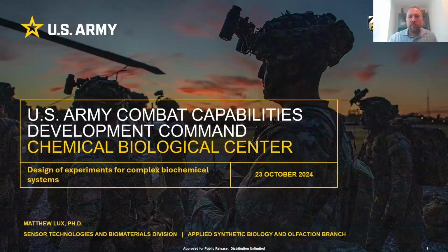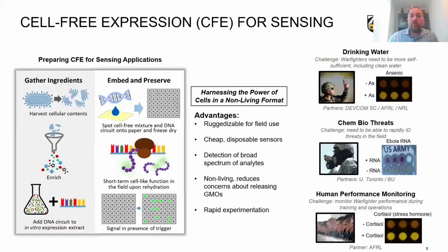So for some background context, we work on something called cell-free expression systems. In much of biotechnology, you use cells, which are great, amazing little machines, but they can be very difficult to manipulate and work with. In cell-free systems, instead of manipulating the cells, you grow a bunch of cells up, you break them open, you harvest their guts, and you take that molecular machinery combined with the DNA that encodes for the function that you're interested in.